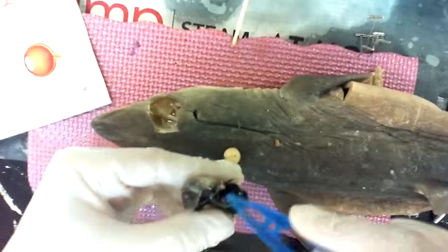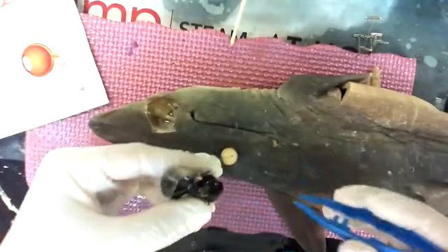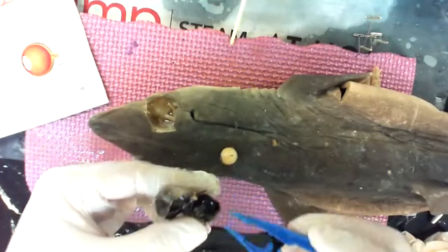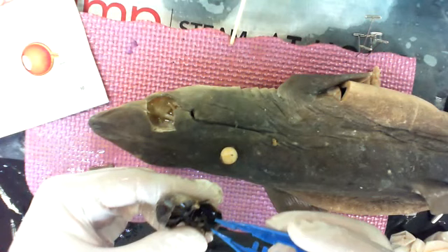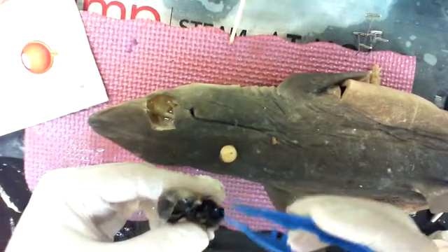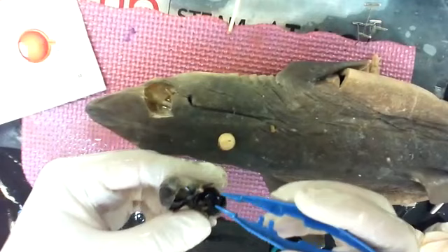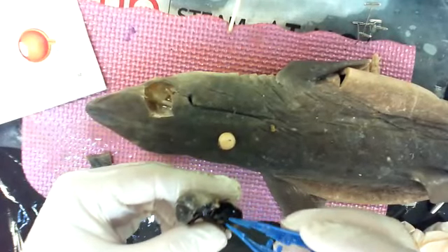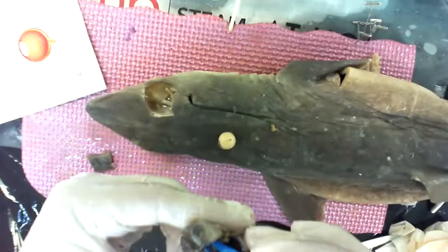In the very, very back, you have the retina. And the retina has the rods and the cones. Rods work in the dark and in the light. So it's like a black and white picture for you. Cones show you color. But the cones are really limited to one spot. So it's actually better for you to see details of things at night because those colors actually mess with your vision. It seems like it's wrong, but it's very true. You have way, way more, about 10 times more rods than you have cones, and they're spread all over the retina. The cones are only in one spot, and I'm trying to find it. That one spot is lighter in color.